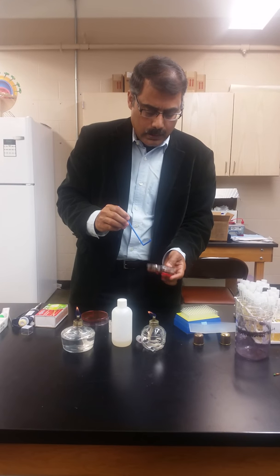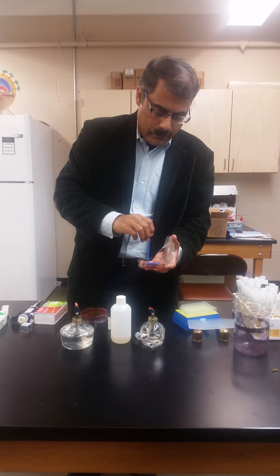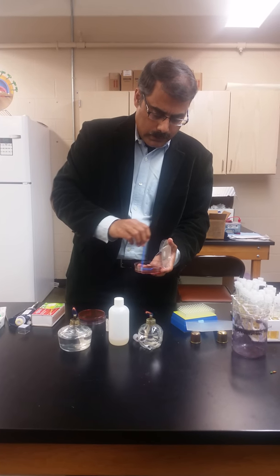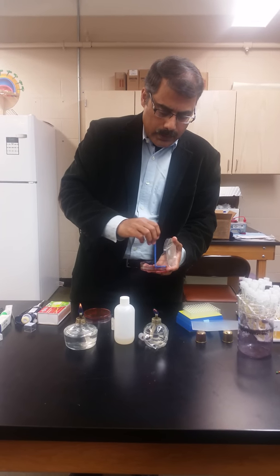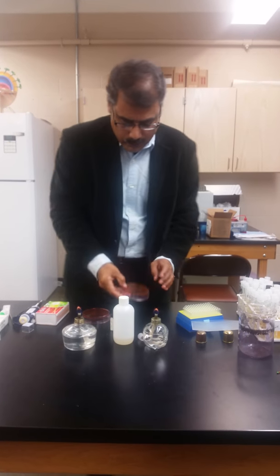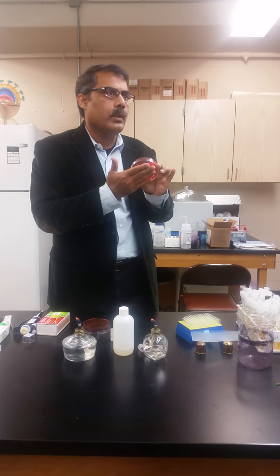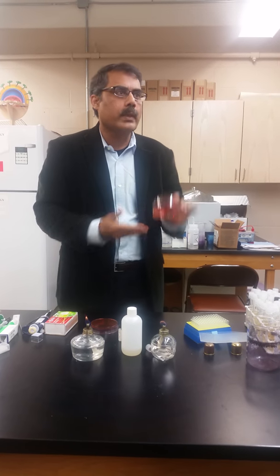Or just rotate it one time. Once you have done that, this has bacteria on it. Goes in here. And now it's a lawn of bacteria. When they grow, they will just basically grow everywhere.